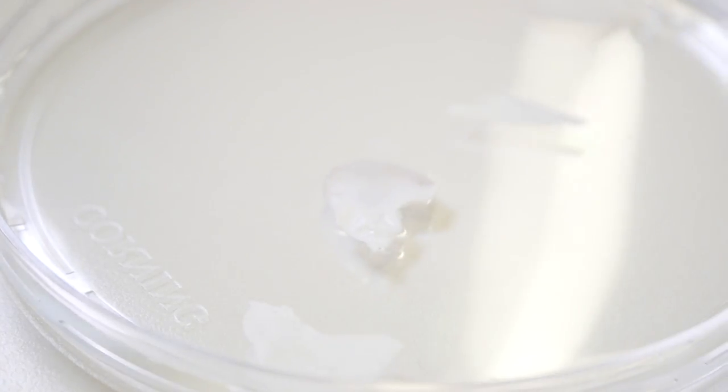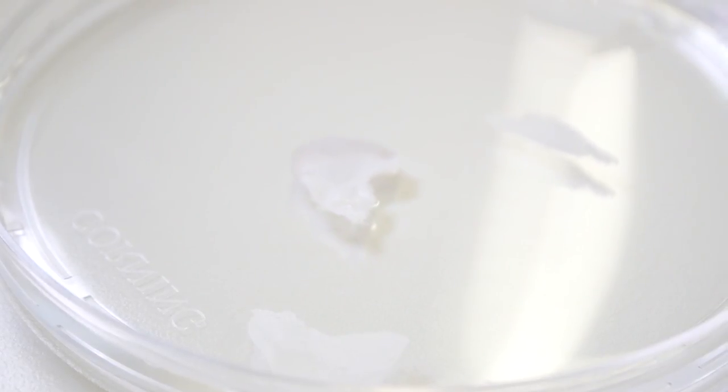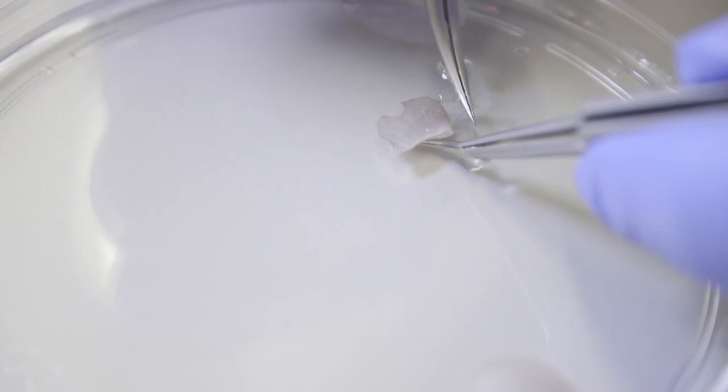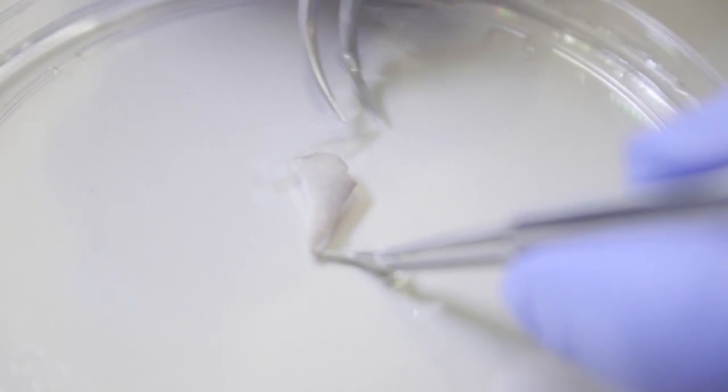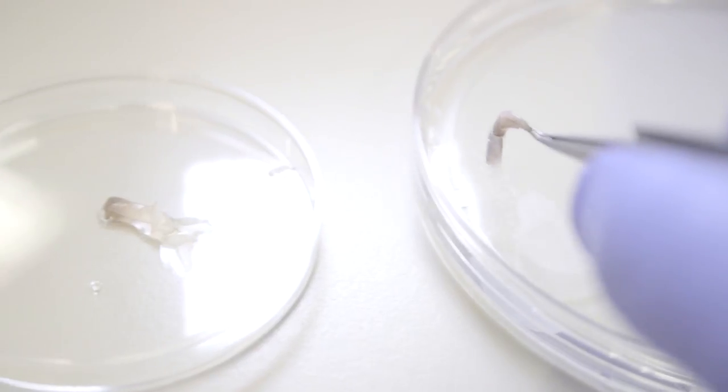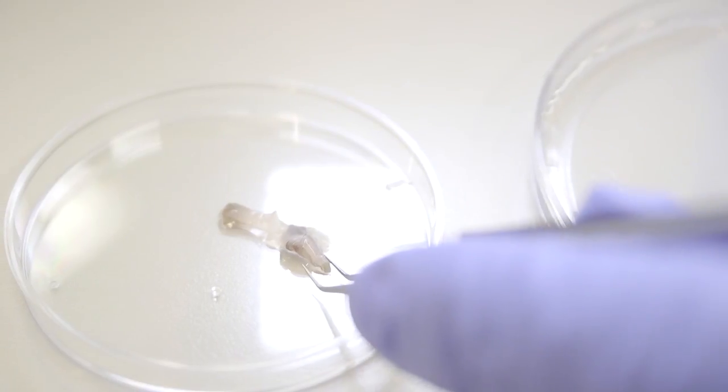This sheet is very delicate, so care must be taken not to rip it. The semi-transparent epidermal sheet should be left afloat on the PBS, whilst the dermis removed from underneath should be disposed of in the small petri dish.